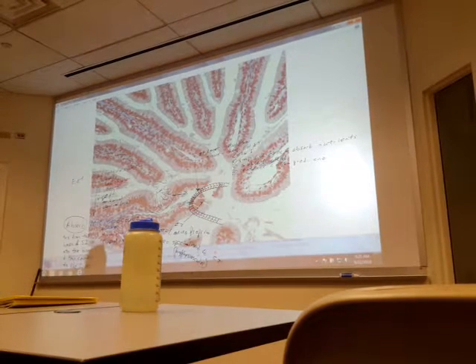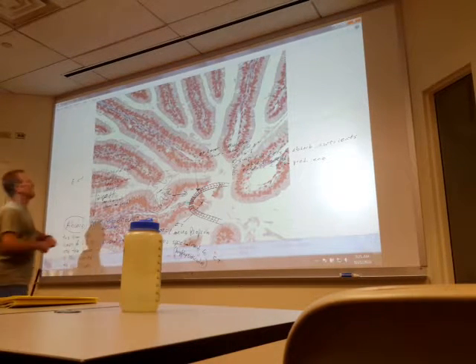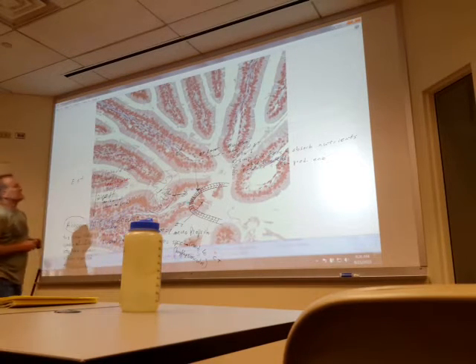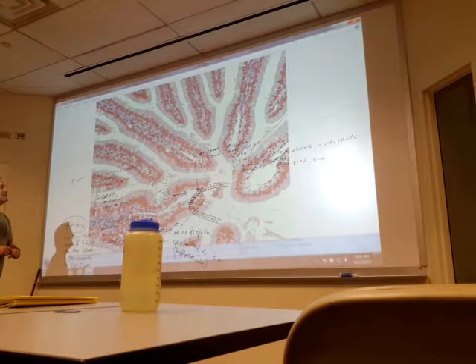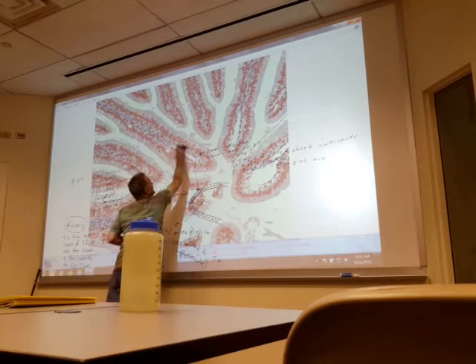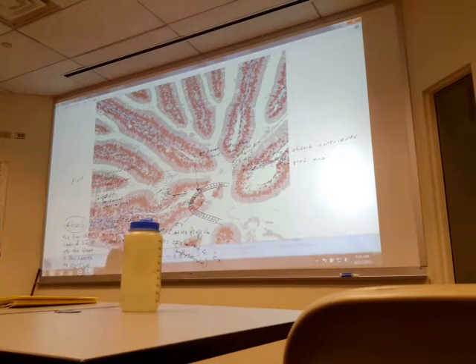You need a little more perspective. There you see a bunch of villi. So here's our lamina propria. We don't see the structures that I need you to see. They're in there, and if we could magnify things about 150,000 times, we'd see them.